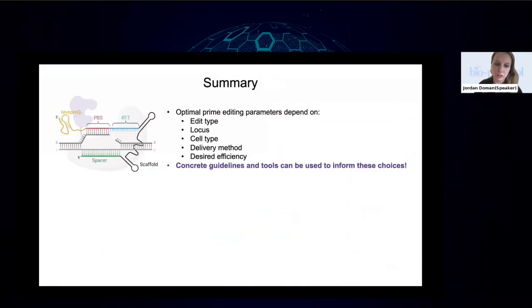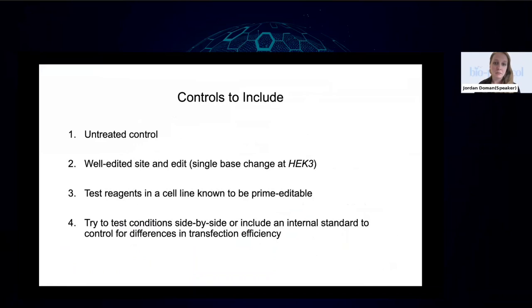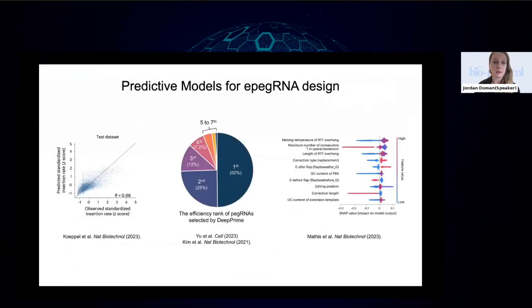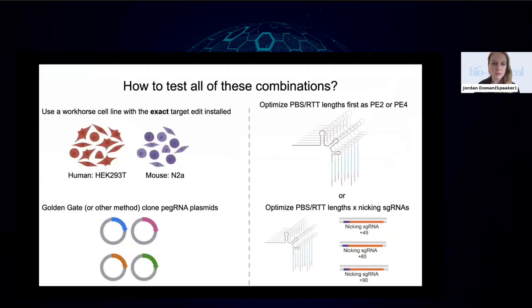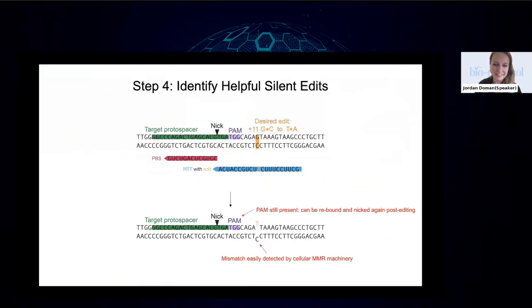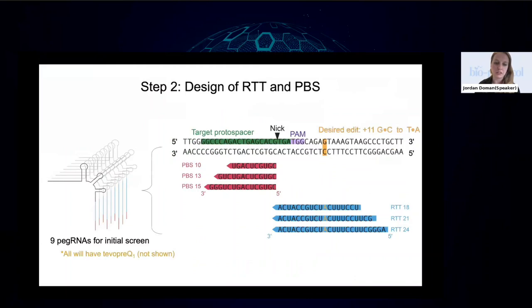Yeah, that's a great question. Honestly, it's not great. I think people in our lab have had some luck with SpCas9 PAM variants. NG does okay, and some of the Cas9 variants published by Shannon Miller and Tina Wang in NBT also do all right. But in general, SaCas9 does not perform well as a prime editor, which is kind of a shame.